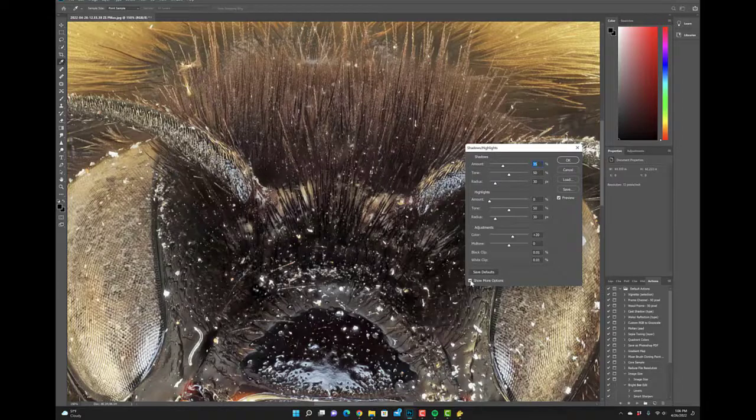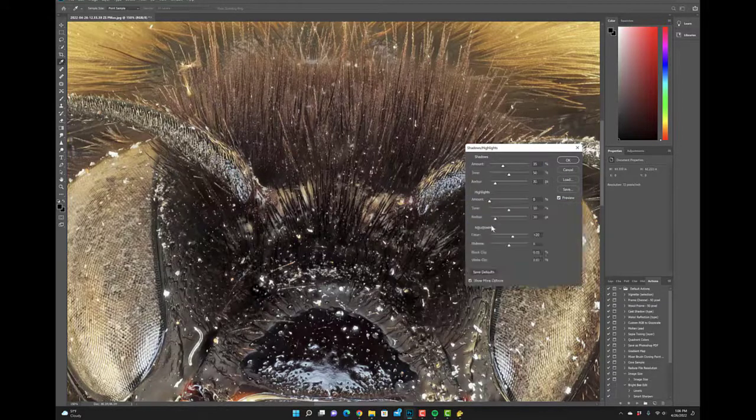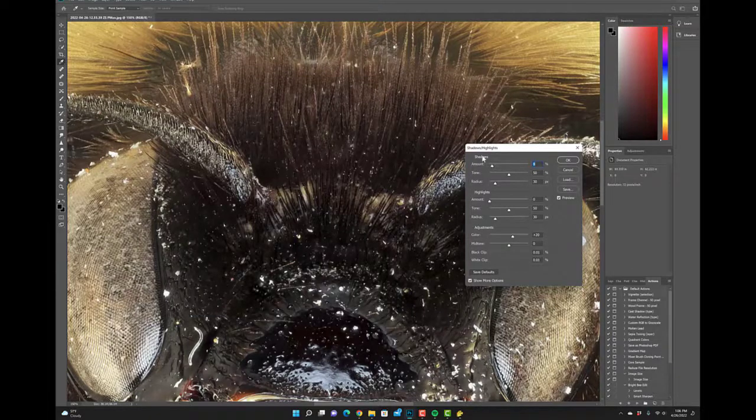You want to make sure that show more options is turned on. You can see you only have two options if it's turned off. If you turn it on, you have a lot more control here. What the software is essentially doing is assuming that the image is quite dark. So it's taking these areas of shadow and trying to introduce a little bit more exposure in those areas just to give you a little bit more light.